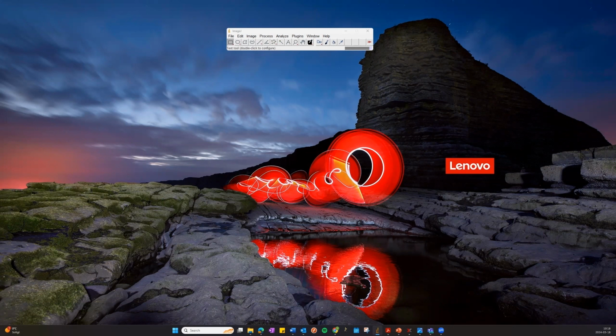The reason for this is that if a maximum projection image of the 3D Z stack is used, there's a risk of creating false positive overlapping fluorescent signals, which will then be classified as protein interaction. So basically having rolling circle products being present in separate Z slices. And therefore, it is important to not use a maximum projection image of the 3D stack.